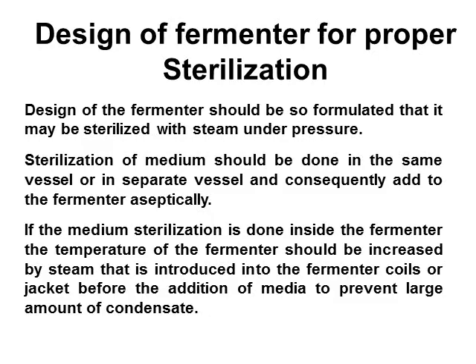Friends, sterilization is a crucial process in fermentation processes. Here we are discussing this crucial process for the fermenter. Before discussing sterilization processes, let us discuss the design of the fermenter that leads to proper sterilization of the fermenter. Design of fermenter for proper sterilization.